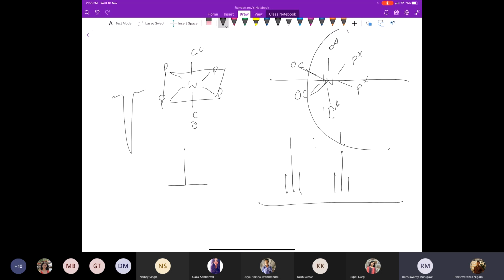And then your tungsten coupling will be different for the cis one compared to the trans one. For the cis one, you'll have a smaller coupling constant in the satellites, whereas you'll have larger satellites for this here. This tungsten is something I'm carrying with me because tungsten is also NMR active, but it could be molybdenum, then you can forget about that. Do the thing very easily.